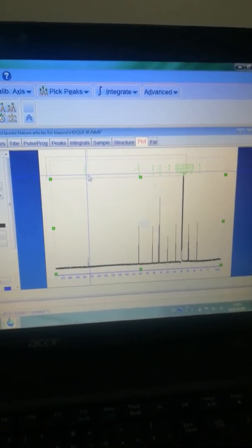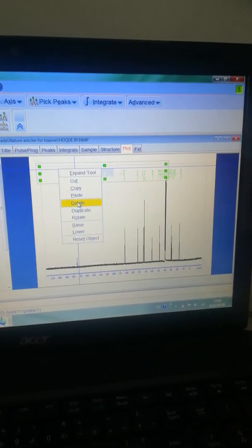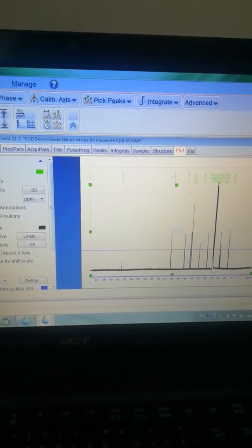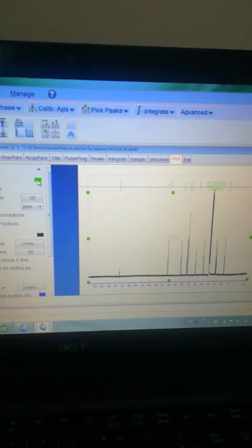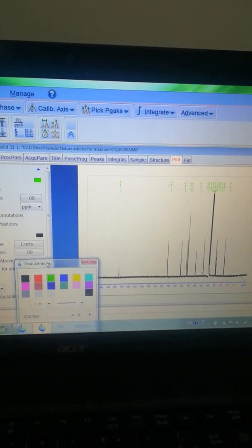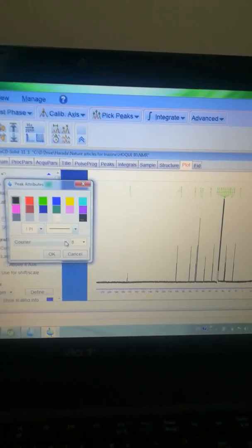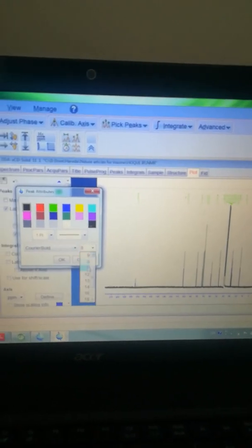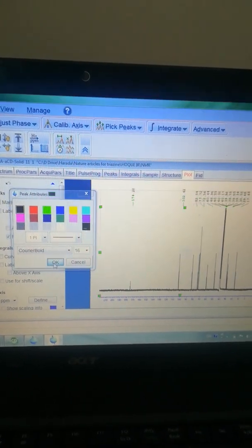I already expanded the spectrum box and now I'm going to increase the font. Click on the peak picking option. You can see the peaks are currently labeled in green color. I'd like to expand and select black color, and also increase the font — Courier Bold 16 is quite good for a manuscript. Click OK and now it's appeared.